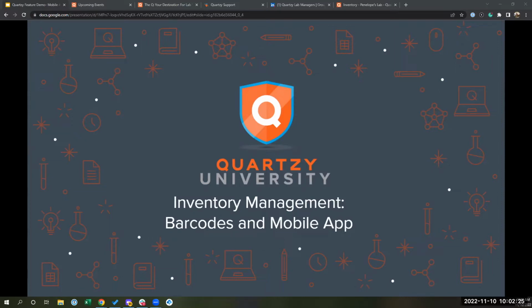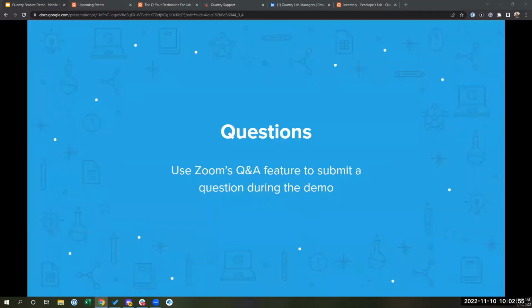This session will go into how to use the inventory module to generate barcodes, and we'll also showcase our mobile app. We will be recording today's session and providing a copy of this and the previous session recordings as a link in the PowerPoint presentation that Libby goes through today. So you'll have all the resources at your fingertips following this presentation. And if you do have any questions during the presentation, please drop them in the Q&A for us, and we'll get to them either live or we'll just answer them within the Q&A itself.